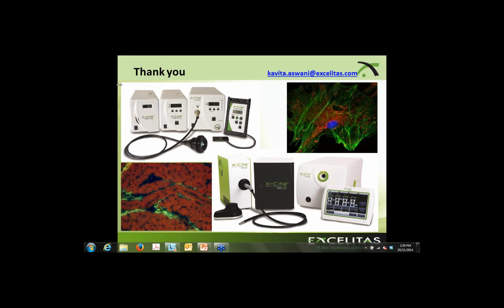So the cell itself has time to relax and not generate too many reactive oxygen species. The second is your fluorophore itself has time to relax and doesn't go into triplet state, which then produces, well, zero fluorescence essentially. So those are the two theories right now, and that's all we have for now. It could be one or two, or it could be a combination.